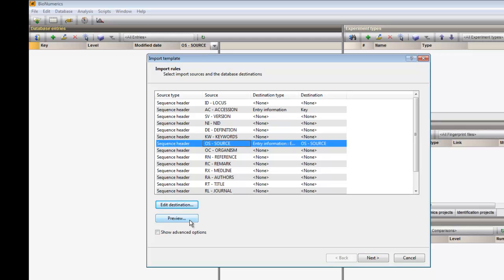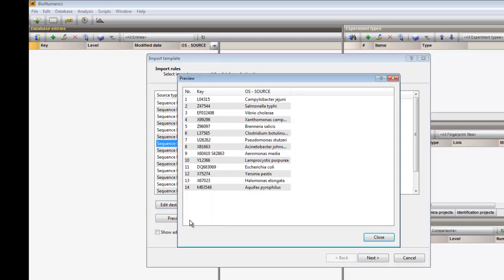By clicking the Preview button, I can check whether the fields have been assigned correctly. If so, I can close this window and click Next.